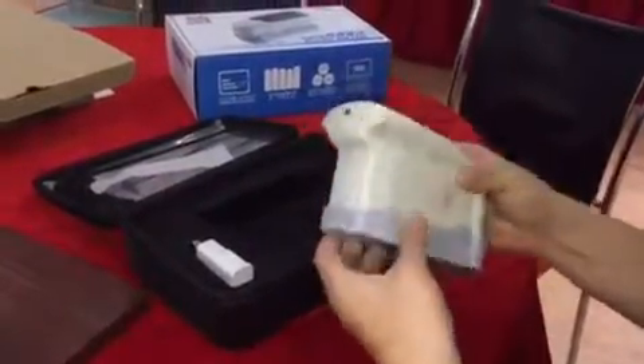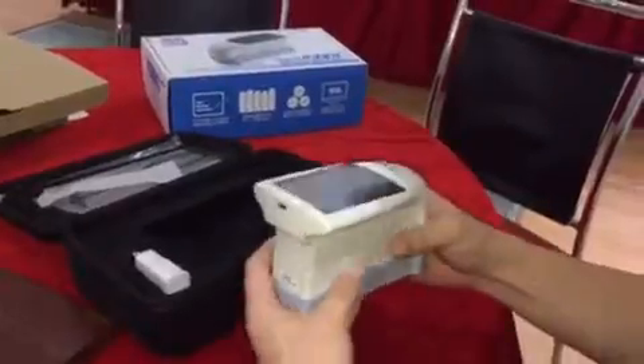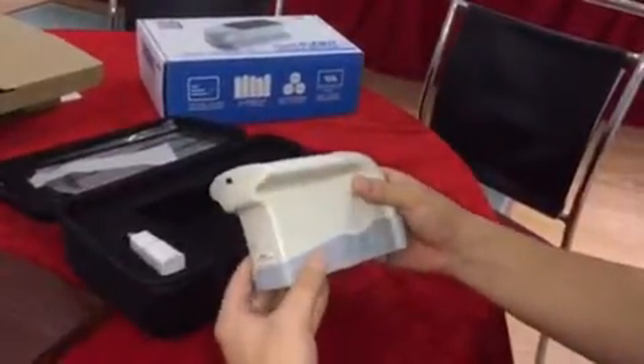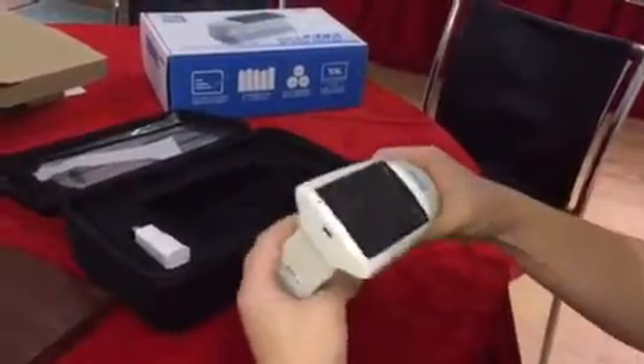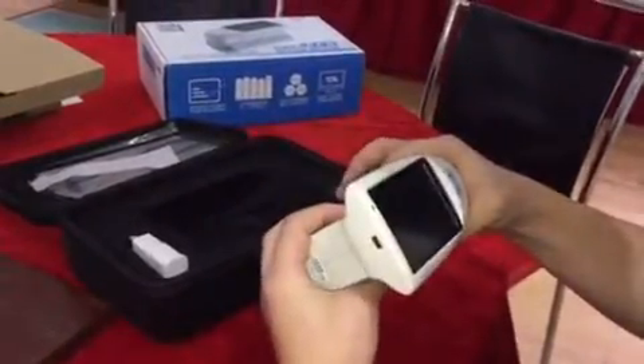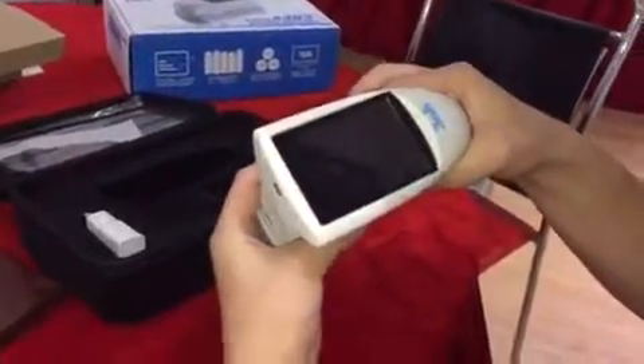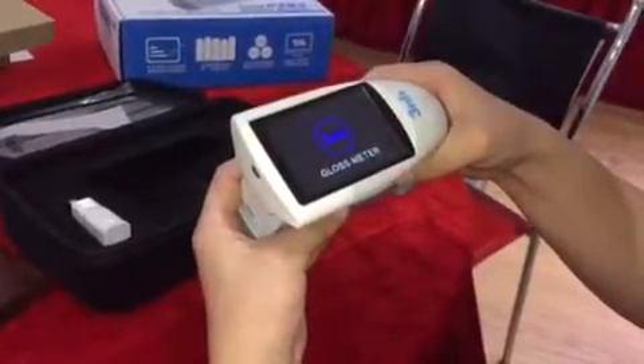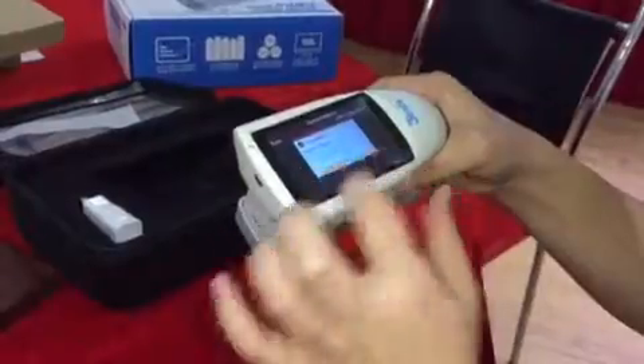When you turn on the glassmeter, the glassmeter will do the calibration by itself automatically — see? Calibration finished.